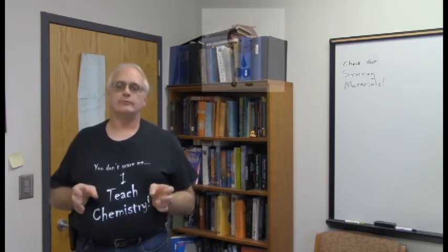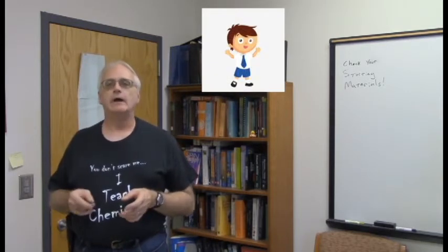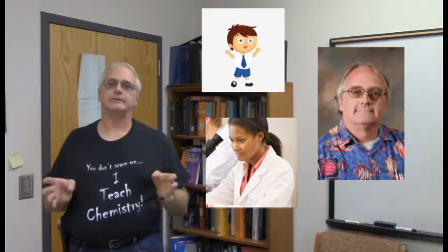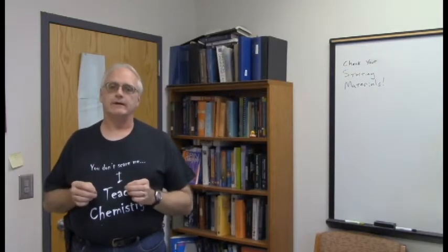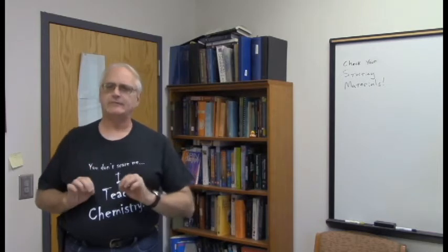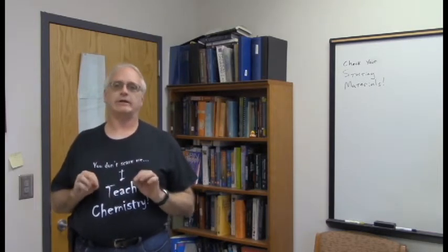Whether you're an undergraduate student starting a research project for the very first time, a seasoned and experienced research scientist, or some poor schmuck with delusions of grandeur down there in hellhole Georgia, if you're going to use a molecule in a synthesis project or study its biological effects or something, then it's really a good idea before you get started to pump a little bit in an NMR tube and see if it's really what you think it is. Okay? That's basically what I mean by checking your starting materials.